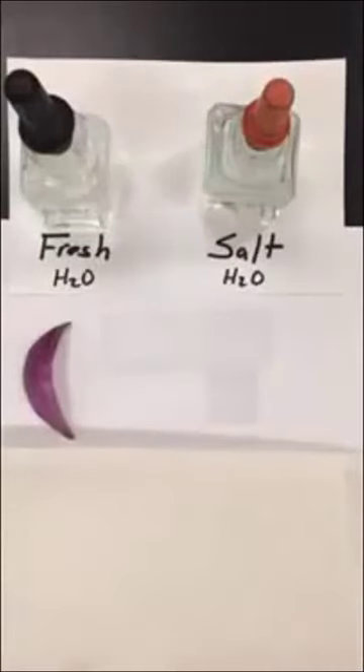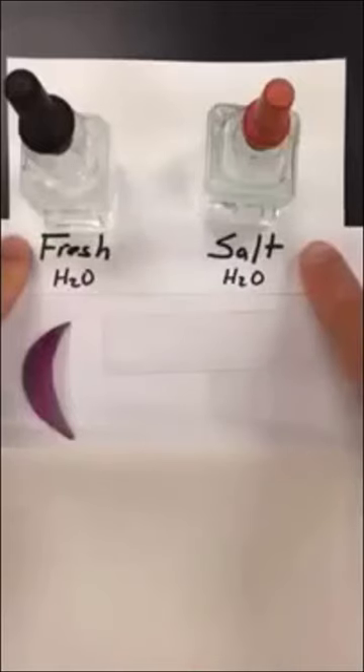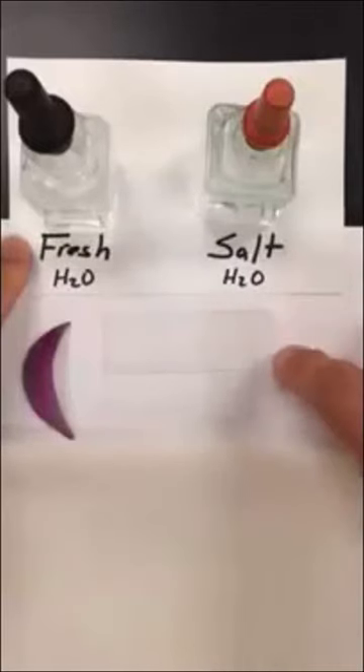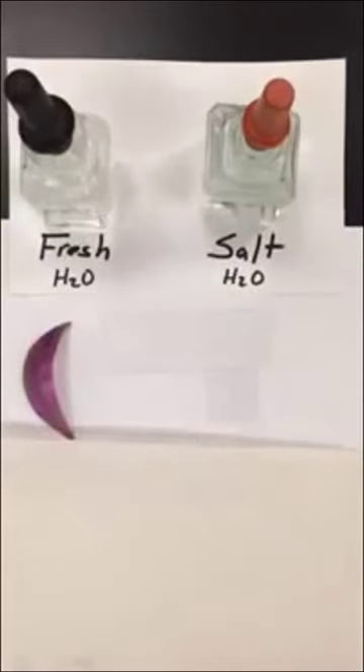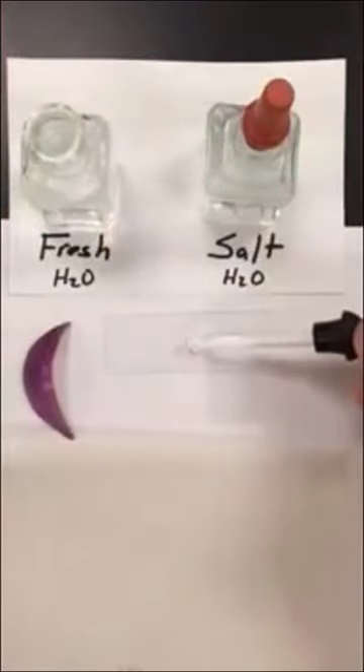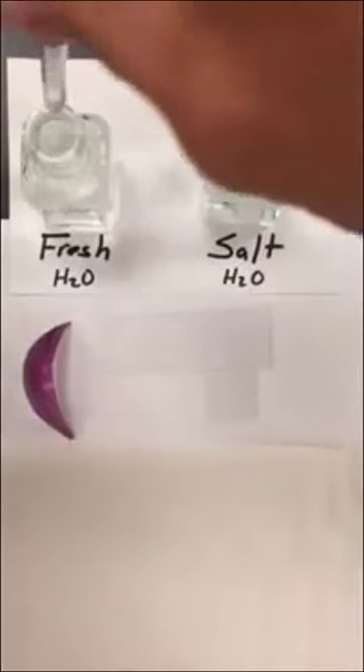Now we're going to learn how to set up a wet mount slide for the New York State Regents Living Environment diffusion through a membrane lab. At your station you need bottles of fresh water and salt water, a microscope slide, a cover slip, a piece of red onion, and a piece of paper towel. The first step is to add about two to three drops of fresh water to your microscope slide, which gives the area for the specimen to sit in.